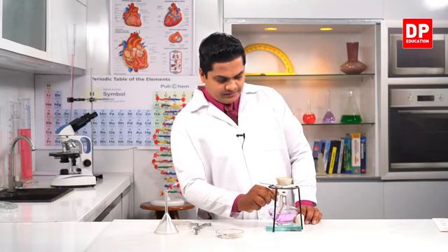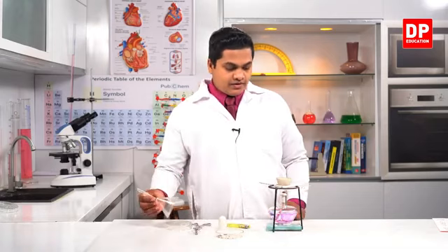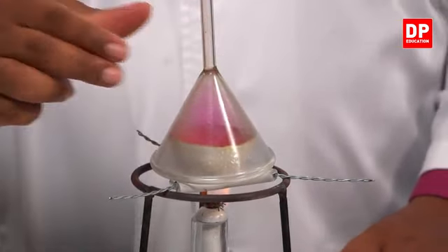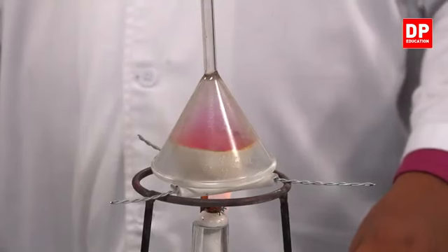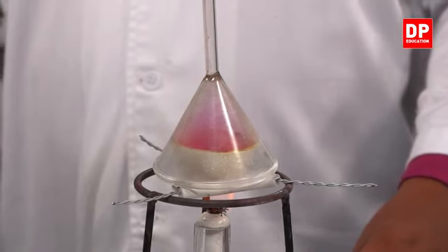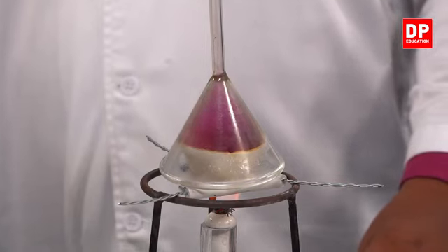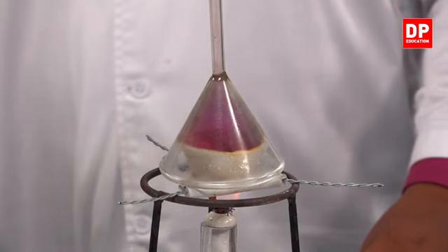So let's heat it, and while it is heating, I'm going to place this funnel on it. Right, you can see that the iodine is going to heat up gradually.